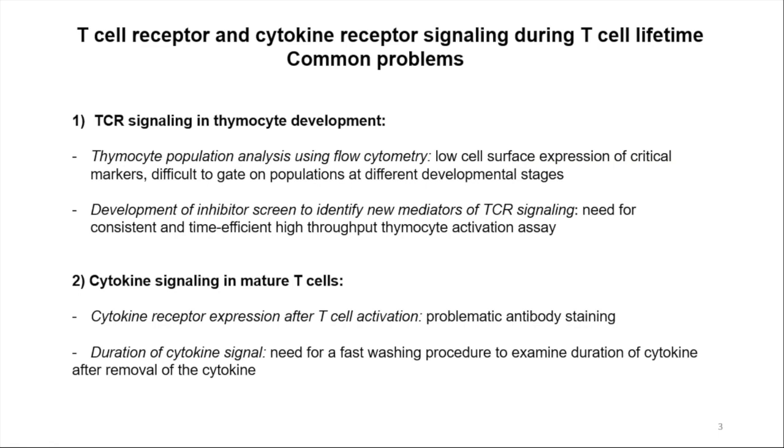Another challenge that we encounter, and Elijah is going to talk about this later, is that we try to develop a high throughput inhibitor screen to identify new mediators of TCR signaling. And for this, we need a very consistent and time-efficient high throughput thymocyte activation assay.